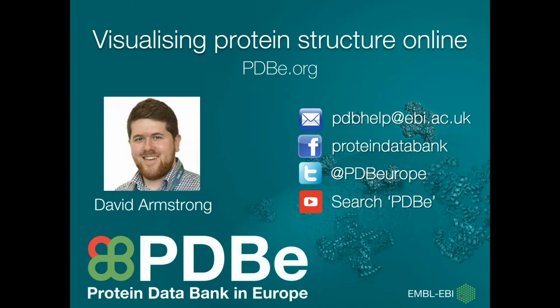So this PDBe webinar will give you an introduction to macromolecular structure visualization at the PDBe, and this is using the new Lite Mol viewer at our website.